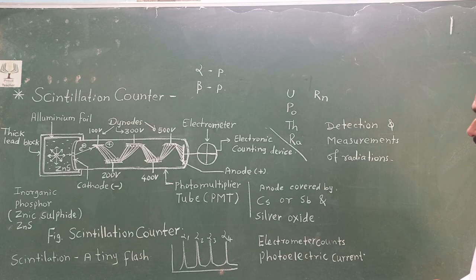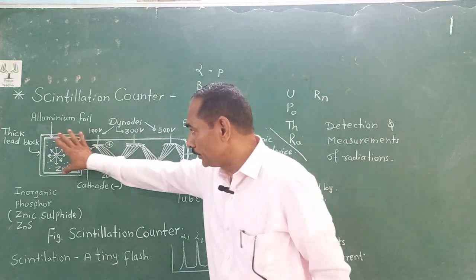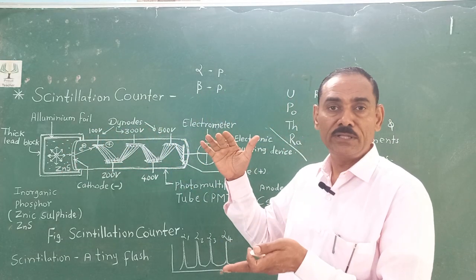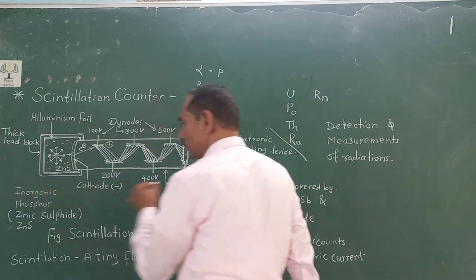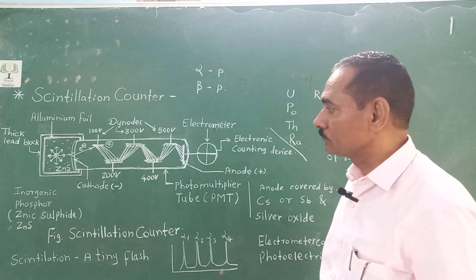Now, this interior part of the scintillation counter is packed in a box, which is a metal box.